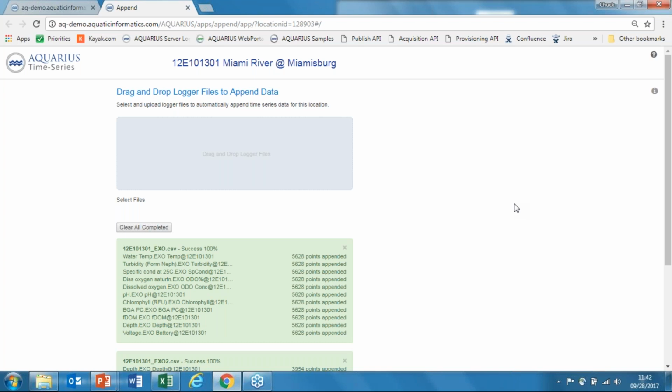And here where we've got 10 or so different parameters, we're mapping each of those 10 columns, and we say what the format is and how the timestamps are oriented. And these configurations are reusable. So what we did was made a configuration for that first SON file, and then we used it as a starting point for the second, and just moved things in the configuration where they needed to be moved, and these are now a reusable thing.